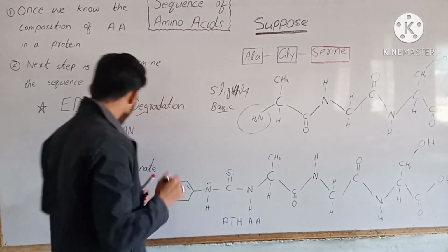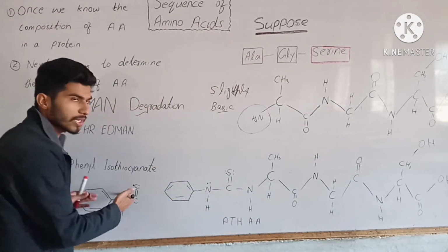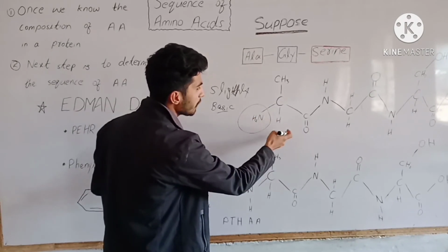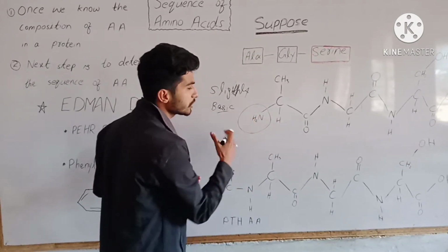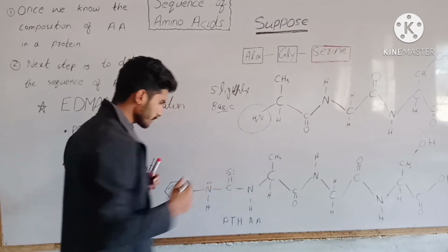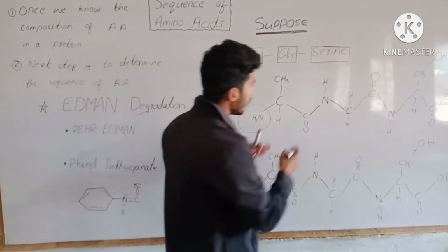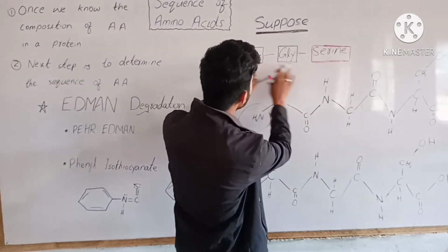Now the next step is to break the peptide bond between alanine and glycine.